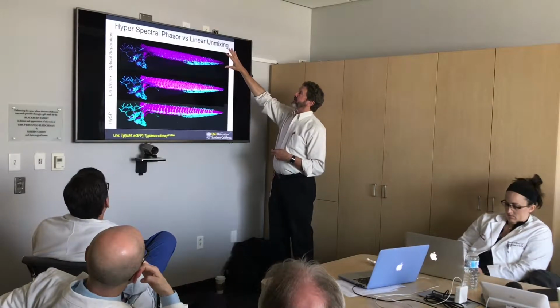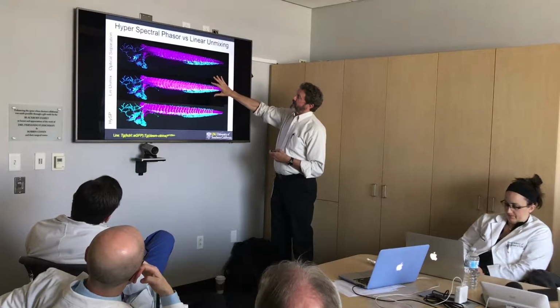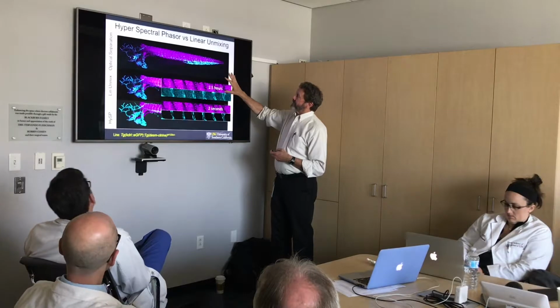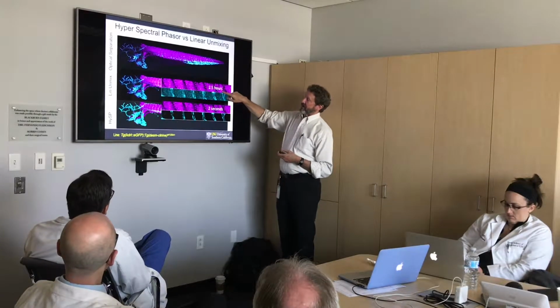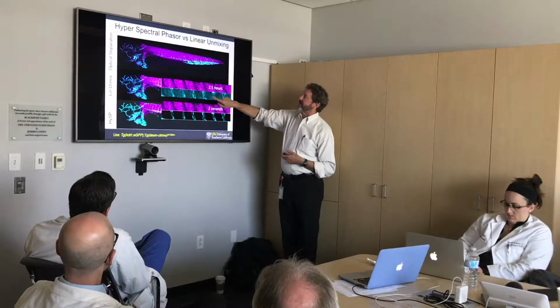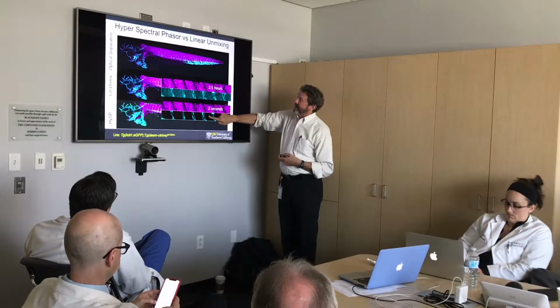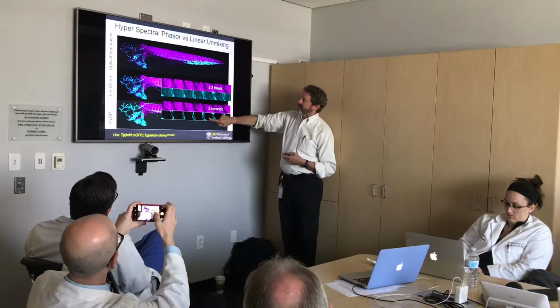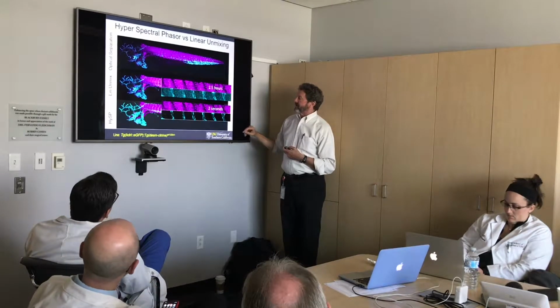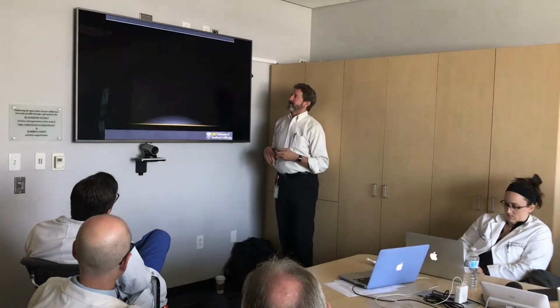And this just shows how trying to separate it out with glass doesn't work. Separating it out, the approach that we sold to Zeiss years ago, works pretty well, but takes a while, and has this noise problem. So there's no blood vessels here in the middle between those two vessels, but there's signal. And the hyperspectral phasor approach gives you dramatic speeding in the processing, because you don't have to invert the matrices, and you can see that the noise goes away.